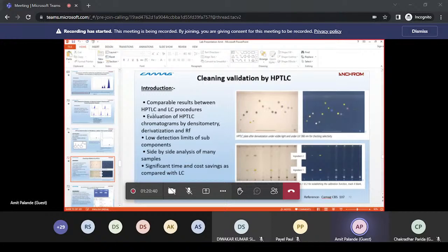One is the quantification and one is the fingerprint method. So in quantification, you can quantify any degradation that happens in the sample, or by using the fingerprint method, you can detect if any extra band or any one less band was there. So according to that, you can do the stability check studies.